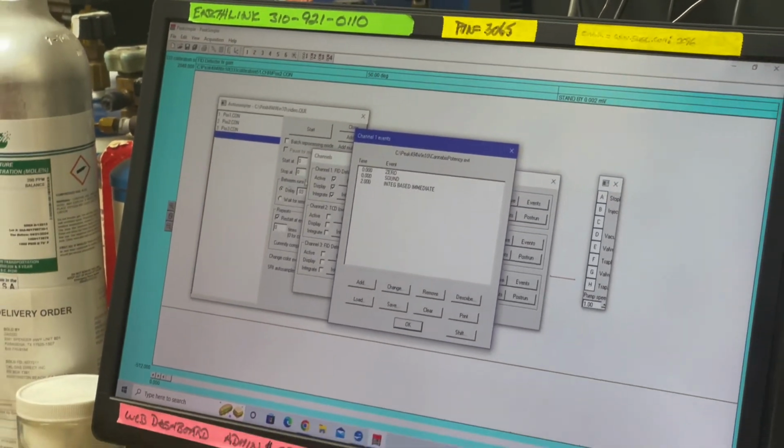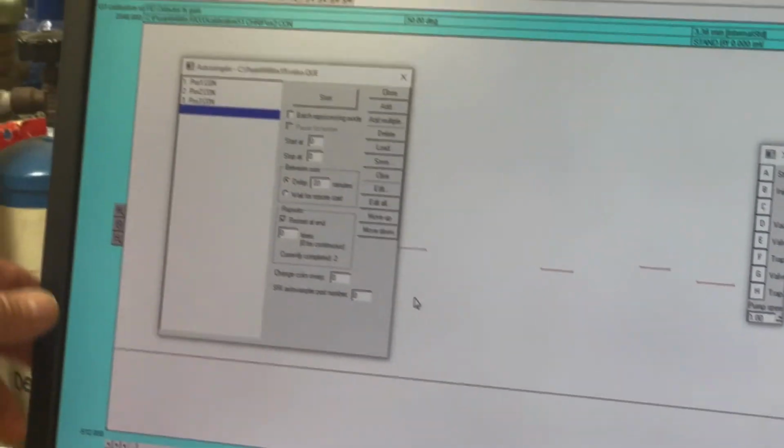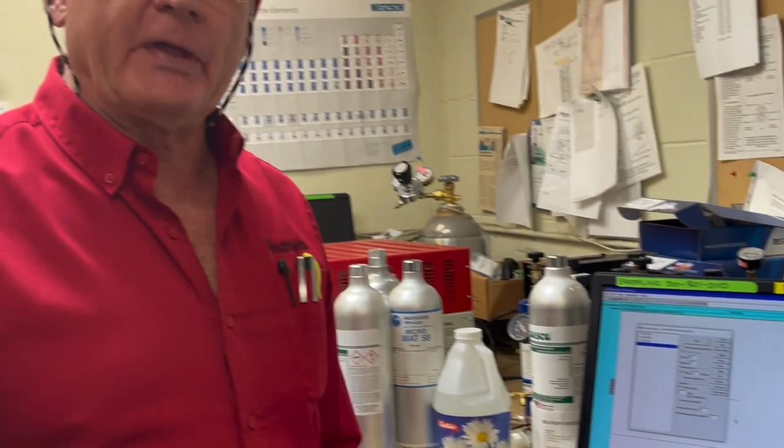There's other things you can do with the Autosampler queue, but for this video, that's enough information. So thank you for your attention.